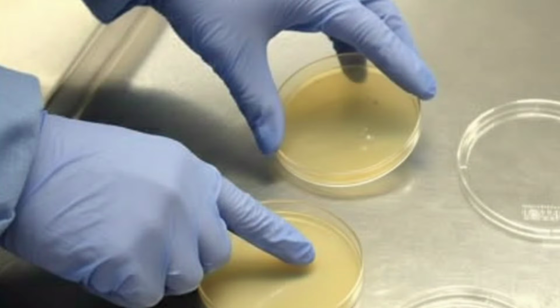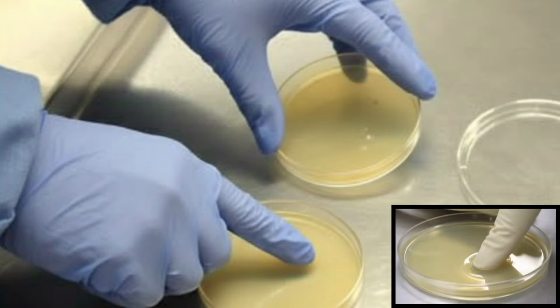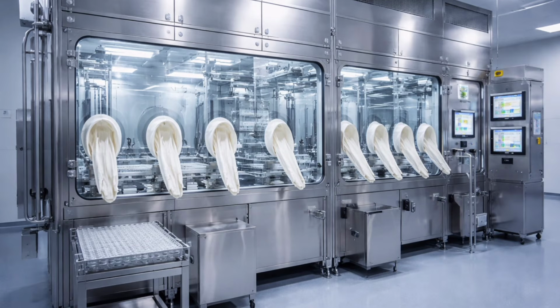In addition, finger tap testing must be performed using a standard 90 mm agar plate at the end of the operation. However, if filling activities are carried out using an isolator system, personnel monitoring is not required for operators, but finger tap is required for each and every isolator glove port.